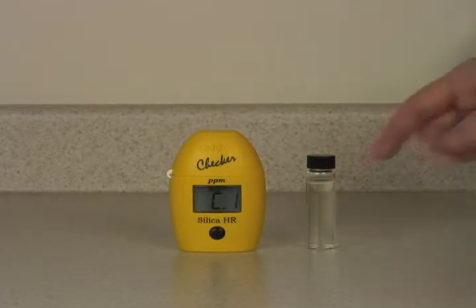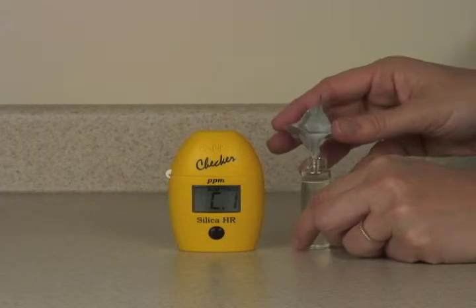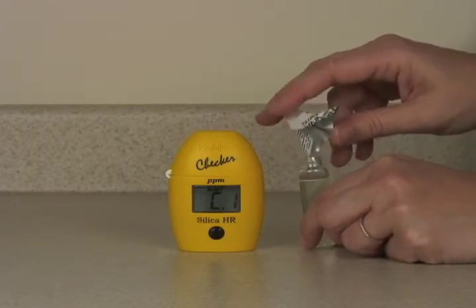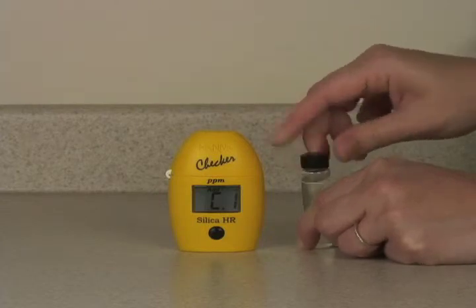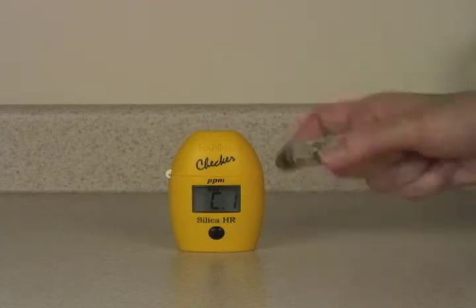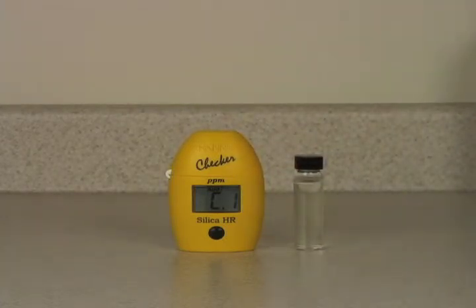After 10 minutes have passed, we will add reagent C. Now we'll shake gently until this reagent is dissolved as well. And now we will wait 2 minutes.